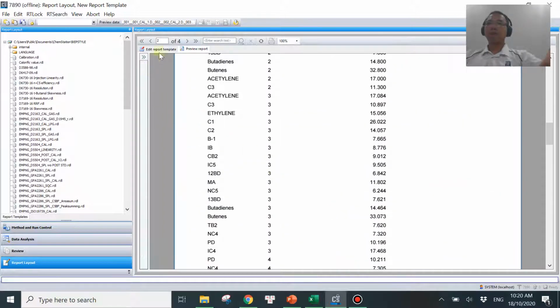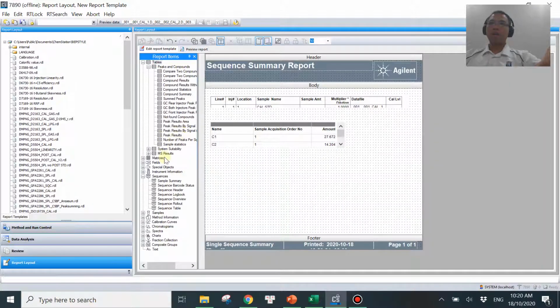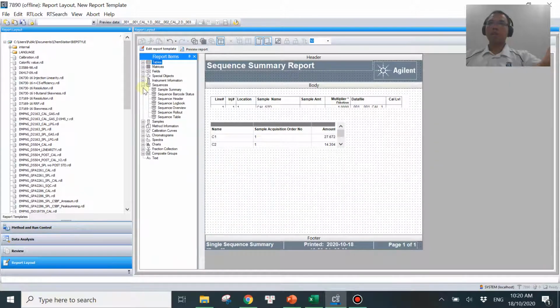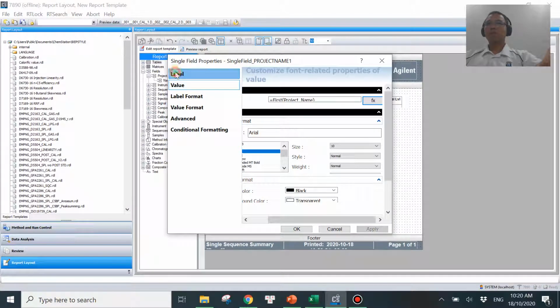So how do you do that? It's very simple. Let me minimize these two tables. You go to fields over here, then you can select any of these. It doesn't matter. Just bring in name. This one will be my LOD calculation. I want to have one more to perform the ratio, right? So I just right click on one of them, go to project name over here, right click on it, and you get this. Go to label over here.